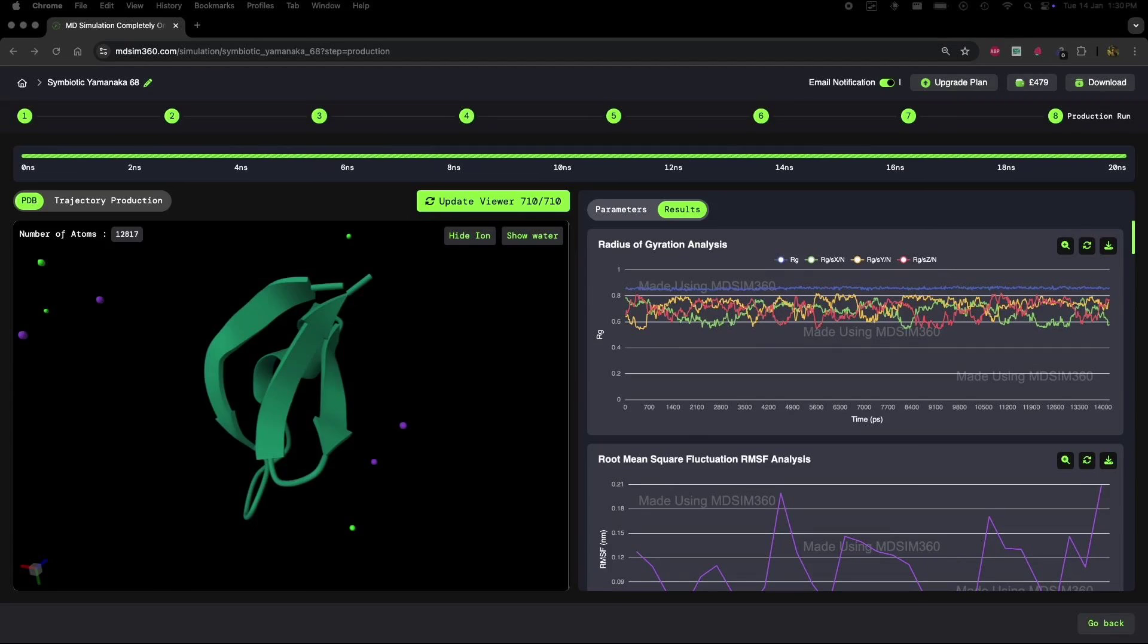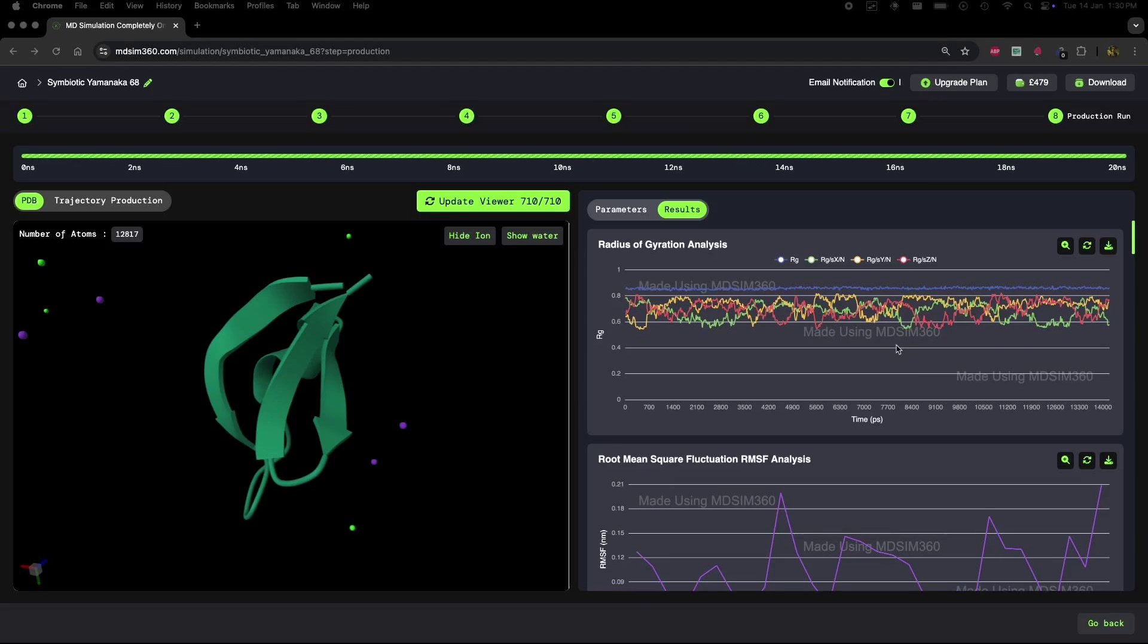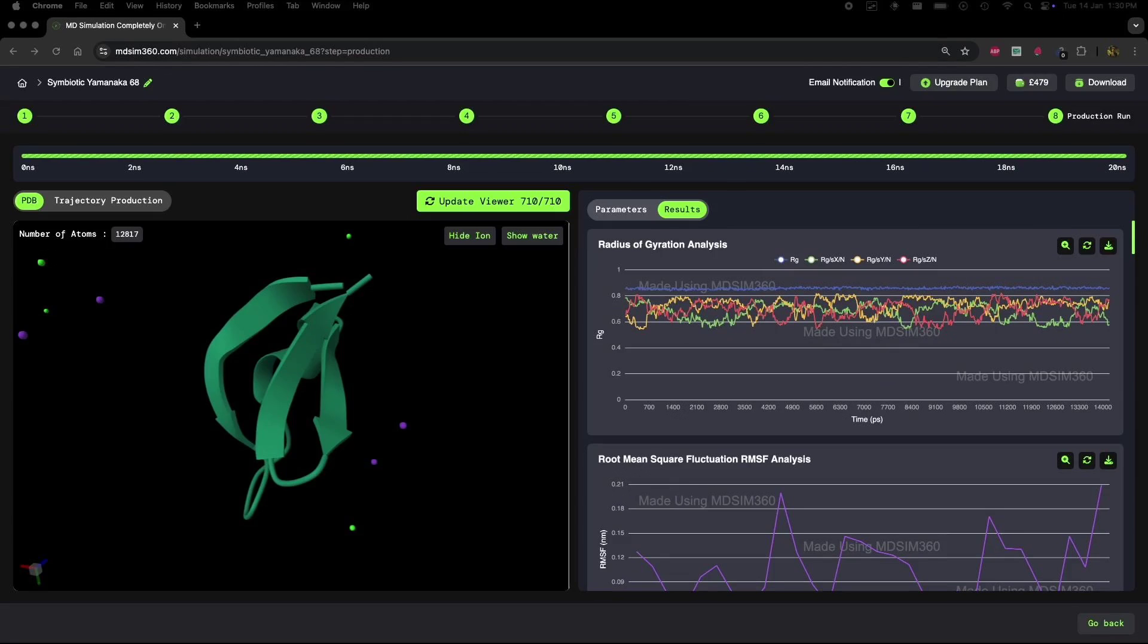Now, for those of you who are familiar with MD simulation analysis, you might think that when you look at the radius of gyration plot and see a stable curve, everything's fine, right? But today, I'm going to show you why that's not always the case.